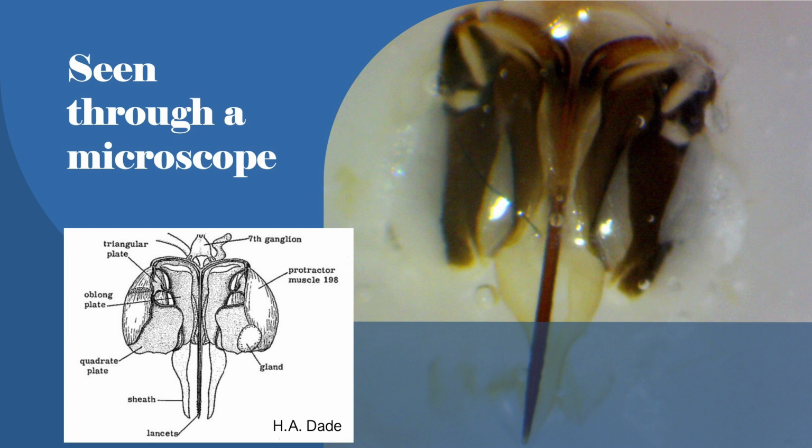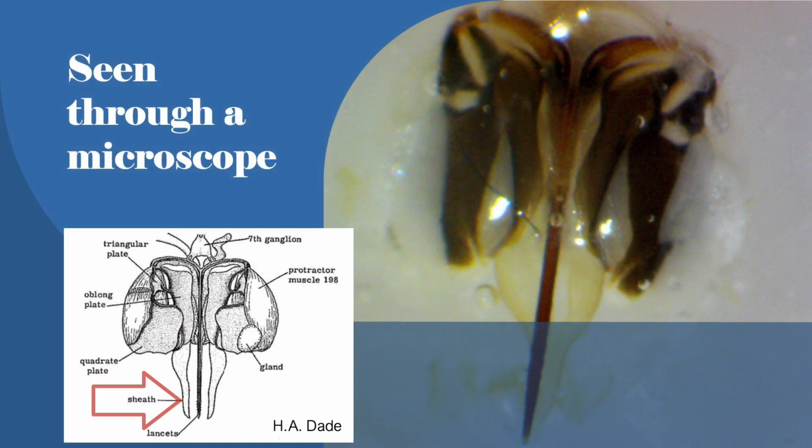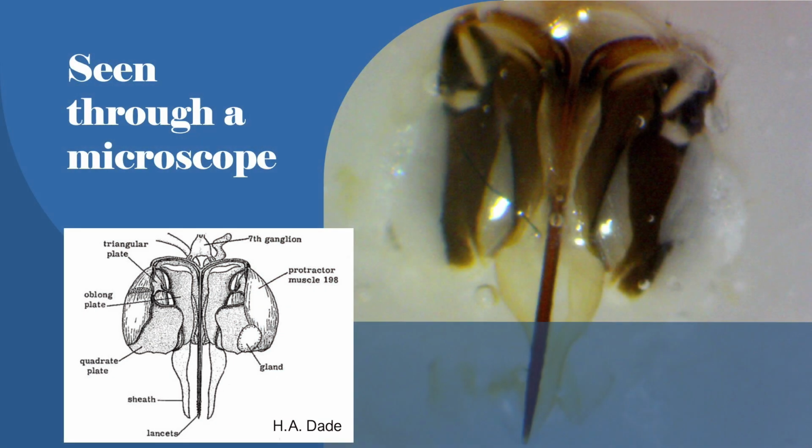It's quite amazing how visible the cuticle is, because it comes from the last segments of the bee's abdomen. And when you see the sting in reality, you can imagine it. For the first 4 or 5 stings I took out, I couldn't work out why I was missing this very strong indication, which is a sheath. The sheath is here, it's quite transparent. When we talk about the sting going into someone's body, it sticks, and we imagine it's like a fish hook. But fish hooks are very fine, and they're even much finer on the actual sting. It's very difficult to see.